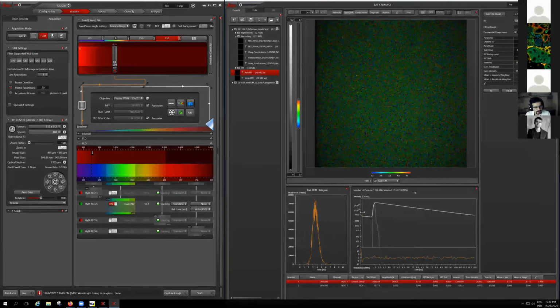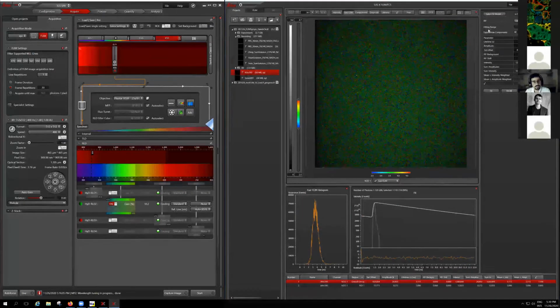I also can adjust the range of the fitting. In the very beginning we have this fluctuation, which I'm not sure where it comes from, but you can ignore the very beginning.